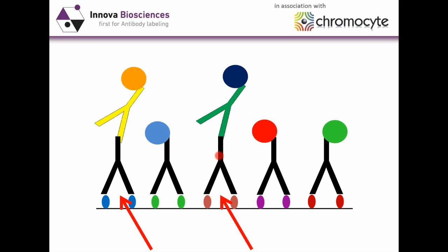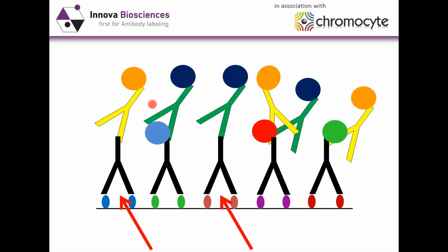A potential option which first comes to mind is the use of secondary antibodies, which will bind to these primary antibodies to give you extra colors and to detect these. But in a multicolor experiment, that becomes a real problem because these secondary antibodies immediately bind to the other primary antibodies, and in effect you simply have what is best described as a bit of a mess on the cell surface, and something that is very difficult to dissect when you're analyzing your flow cytometry data.